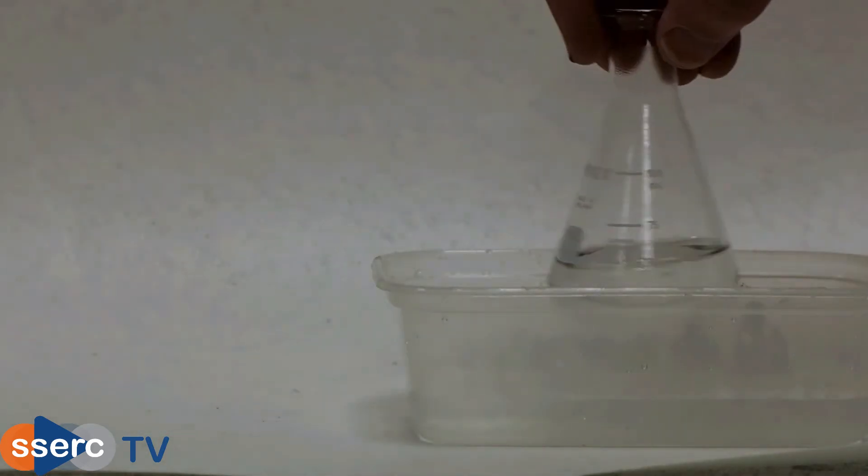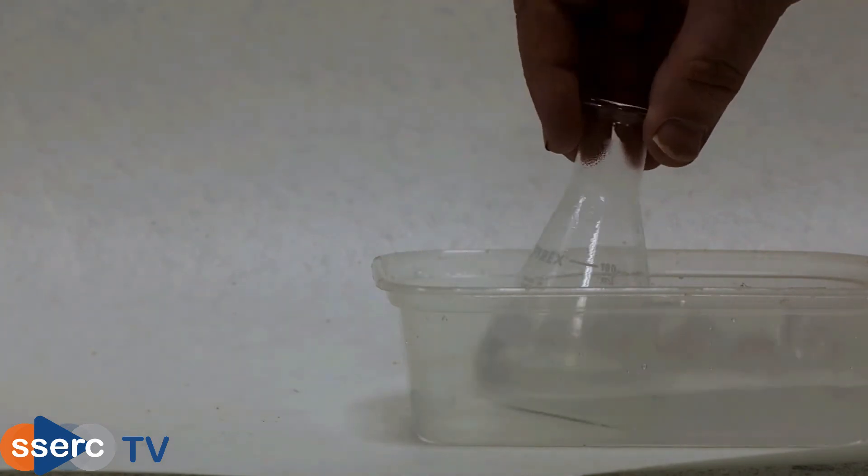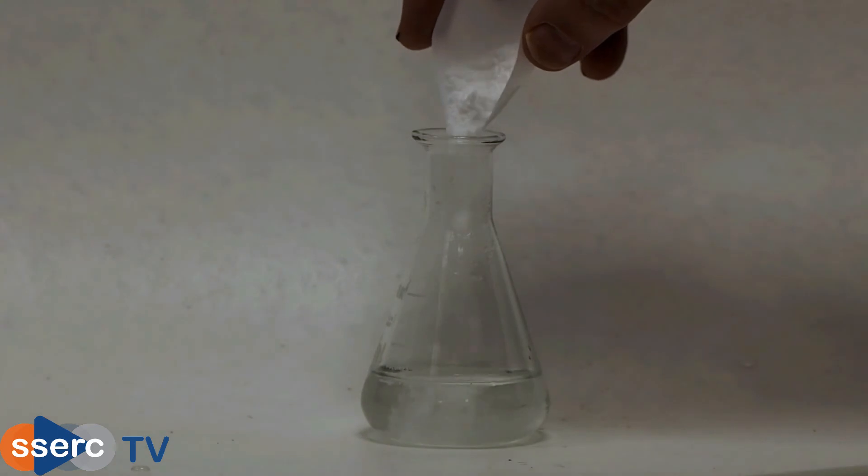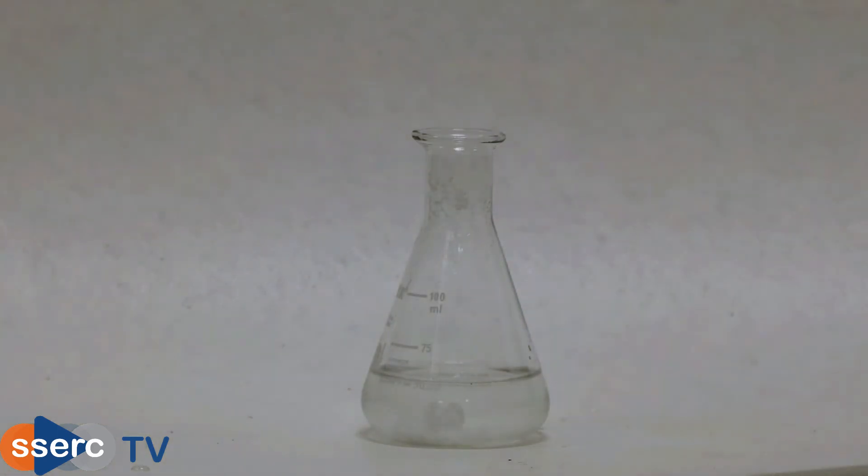Now chill the filtrate in an ice bath. You just need to take it down to about 15 or 20 degrees Celsius. It doesn't need to be ice cold. Once cold, add 2 grams of sodium carbonate and dissolve in the solution.